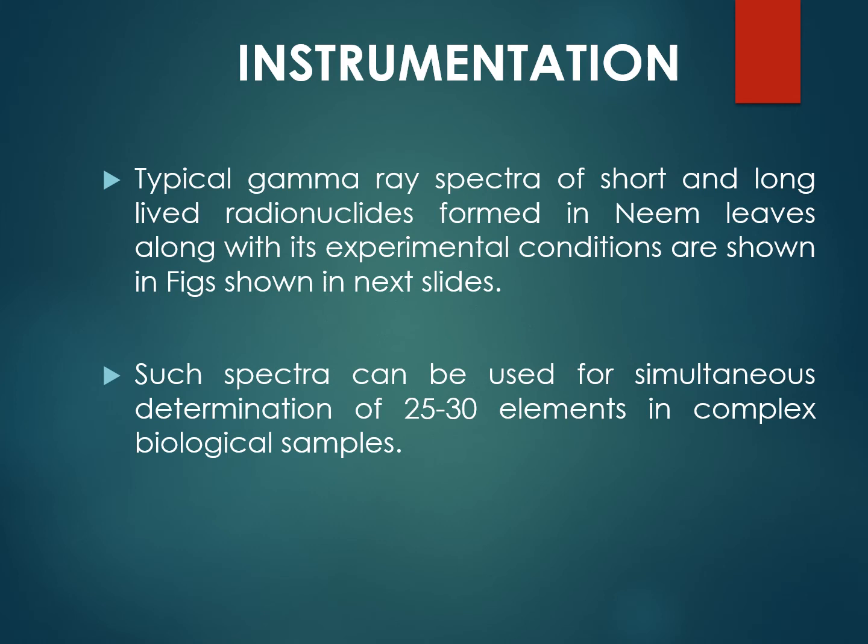Like if we have different samples in which different substances, elements or components are present and we want to determine them, then we use different sample preparation techniques to make our sample ready to be analyzed by those spectroscopic or analytical procedures, and then different graphical spectra are obtained, and those spectra are interpreted to conclude different results.